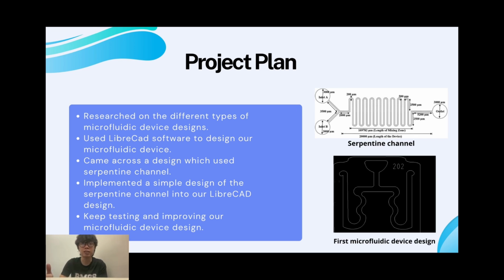Staggered herringbone mixers and serpentine channels are two of the passive designs that are usually incorporated in microfluidic devices to enhance mixing via chaotic advection. I then decided to implement a simple design of the serpentine channels into our LibreCAD design, and will keep testing and improving on this simple design until it was able to effectively produce the results that we need.